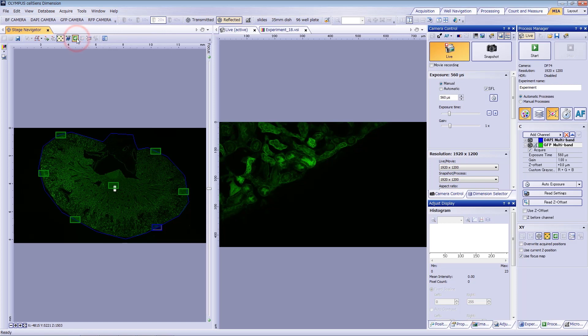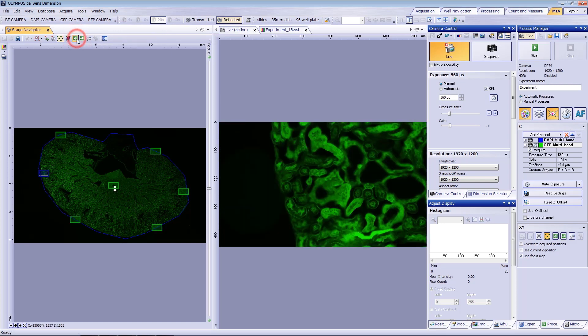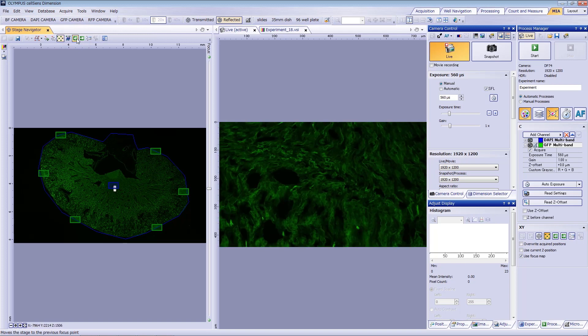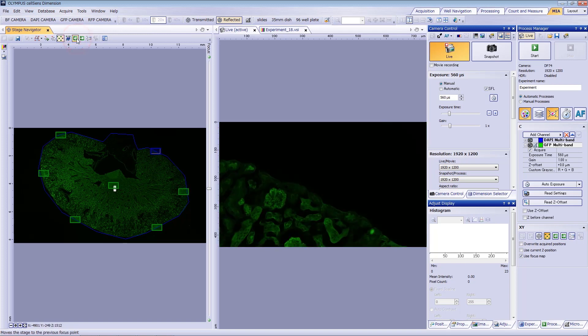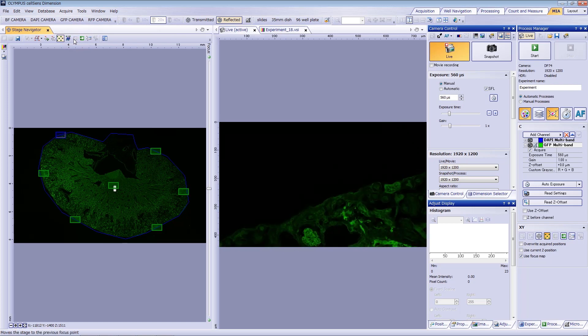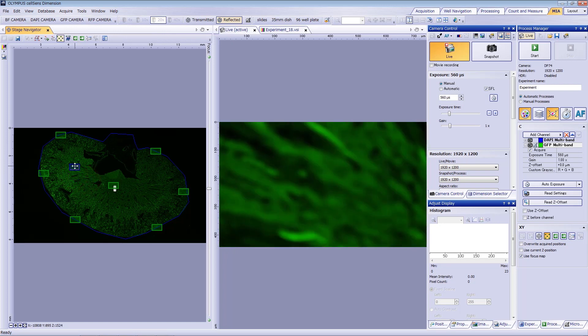Repeat these steps for the remaining focus map positions. When you're done, reverse through your focus map positions to confirm that the focus is correct at each. You can also add positions onto the focus map manually. To add more, right-click on an area and click add focus point. You can drag and drop to reposition the focus point, or right-click again to remove a focus point.